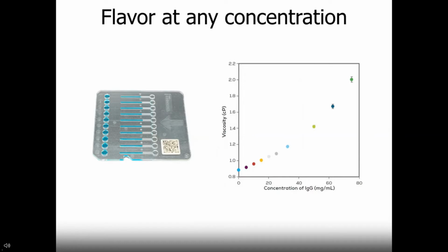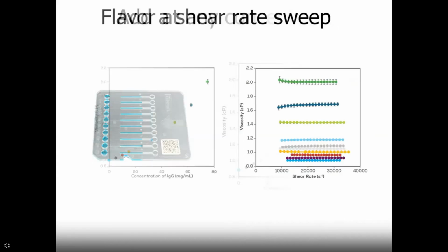And in this case, our standard deviation is actually coming from Honeybun's ability to run multiple shear rates in a single run. So each data point is really the combination of many calculated viscosities. So what that means is Honeybun will start the pressure low and increase the pressure high during each run so that sample starts slowly and runs faster. And we're going to take the average and standard deviation to show that average viscosity here.